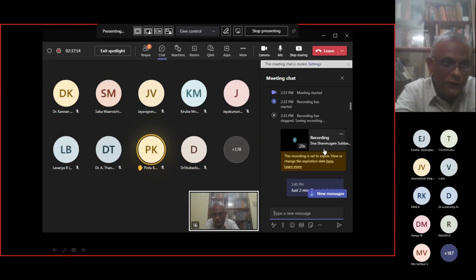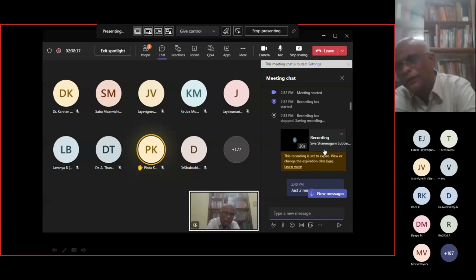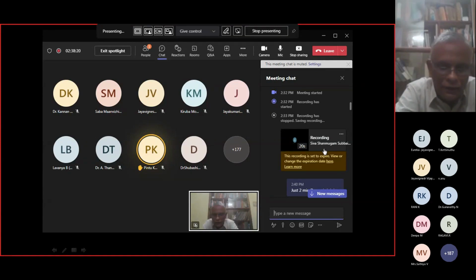I started my career in 1987, and in those days, I would probably have been the first person in South India who used a PDA detector in HPLC, and I compared HPLC analysis many times with TLC over the last 30-35 years. I'm pretty sure that certain things which cannot be detected in HPLC we have detected in TLC, because of which my career has grown to a greater level.